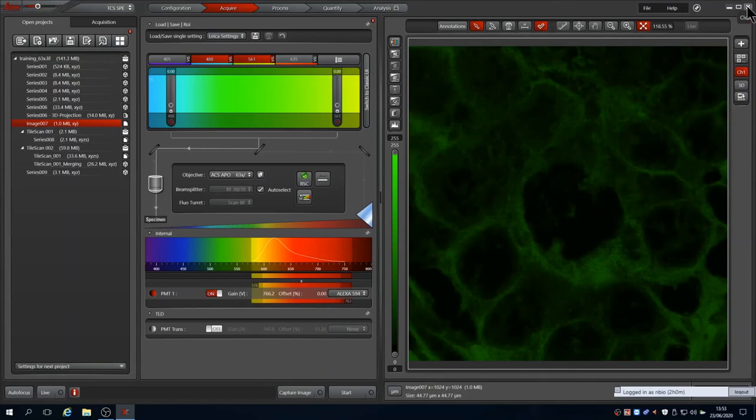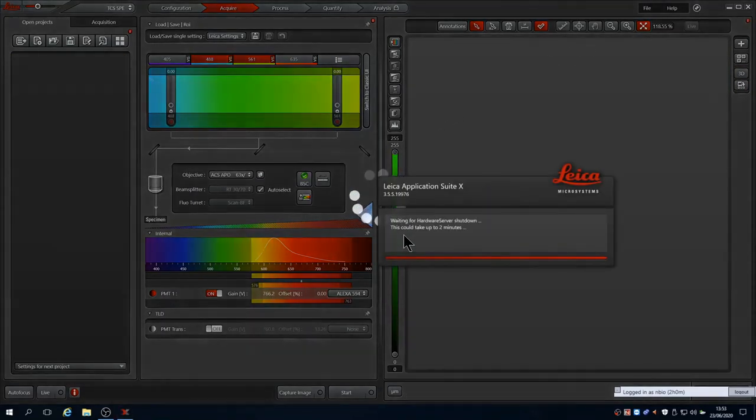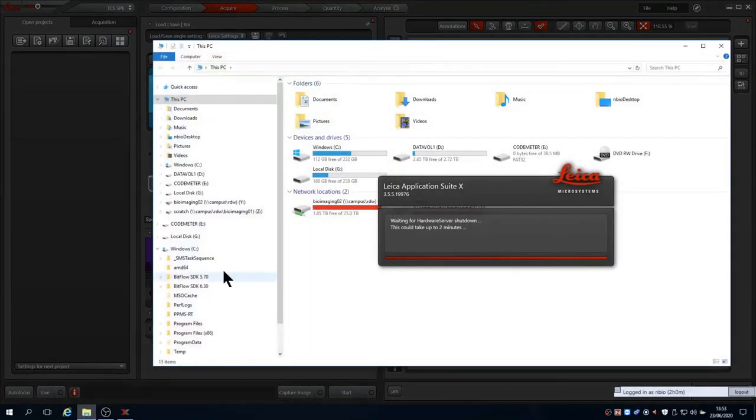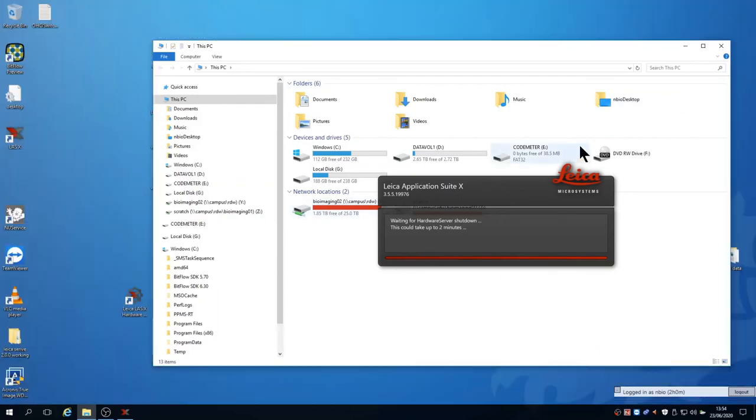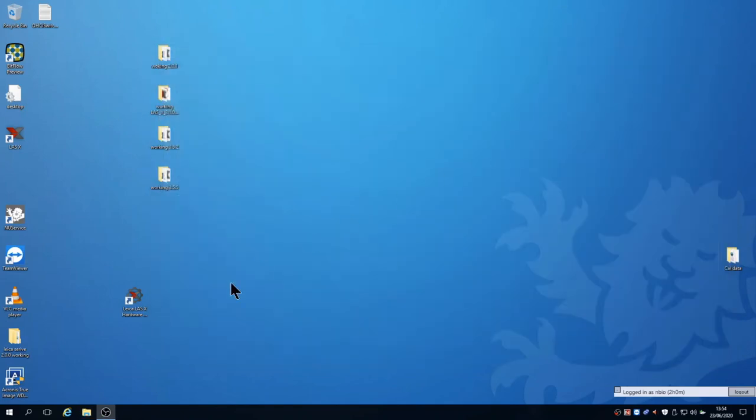Now close LASX using the X in the corner and wait for it to finish shutting down before you switch off the hardware. This gives you time to copy data across the network and remove your sample, ensuring you clean the microscope afterwards. Finally, shut down the PC.